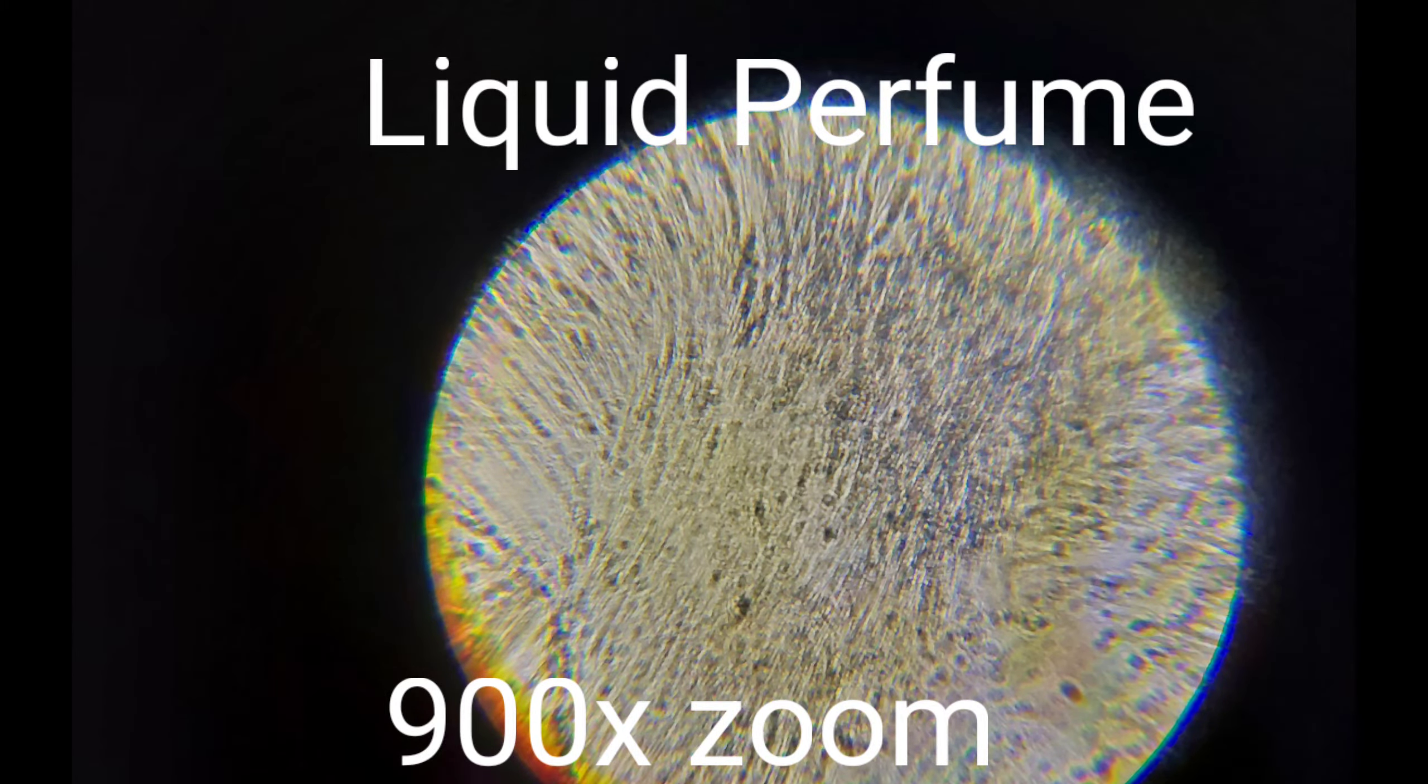All right guys, last but certainly not least, we have a sample of liquid perfume under the microscope at 900 times zoom. So as you can see, it has a ton of bacteria and it's all different colors all over. And I'm not even sure, but this really proves how small bacteria is because the actual perfume sample was completely transparent.